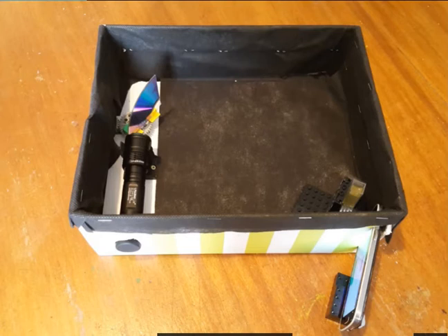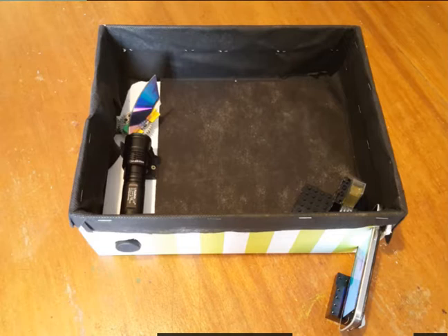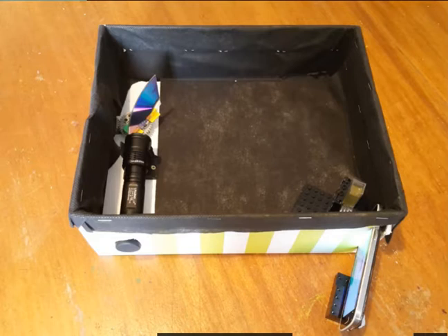This video is to show you how it's possible to make a functioning spectrophotometer from a shoebox, some LEGO, a torch and a DVD and a smartphone that's got a light sensor on it.